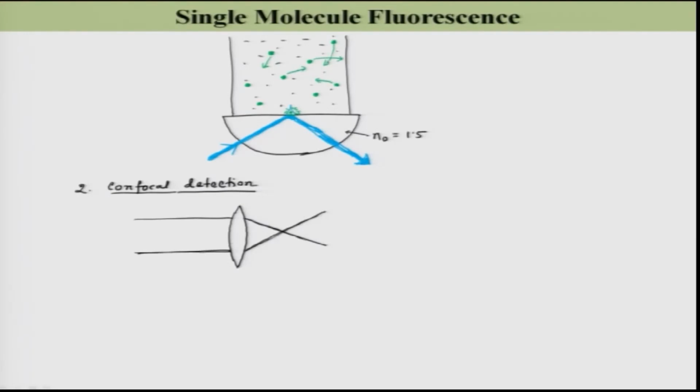Now, this is very much applicable. Now, if I show you another version of this geometry, it looks something like this. Suppose you have this lens over here, and your incoming beam diameter is this much.